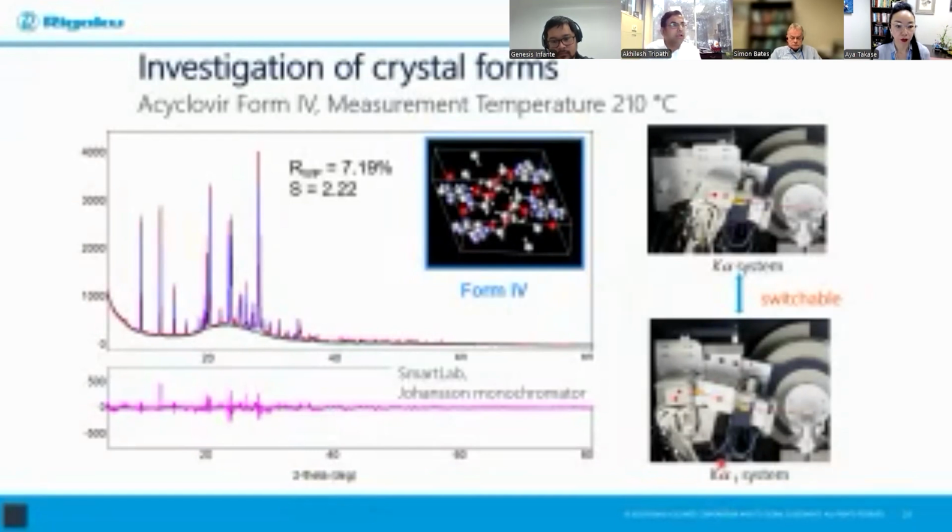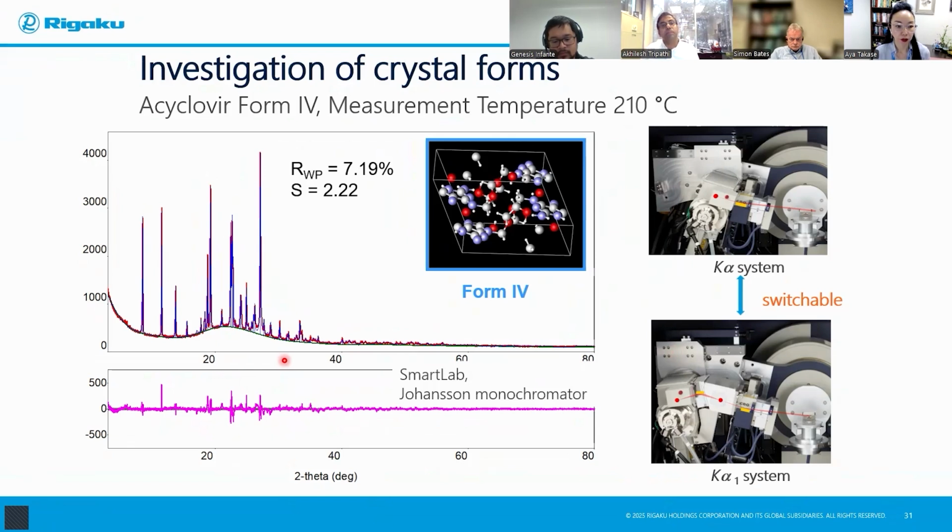Together with a specialized indexing format, rational indexing, as we call it, this can be done very well. In case details about rational indexing are required, do let us know. We have a Dicvol program that picks among the best possible 10 crystal systems, and knowing the volume percentage of the asymmetric unit, this can be well performed using a rational indexing form.